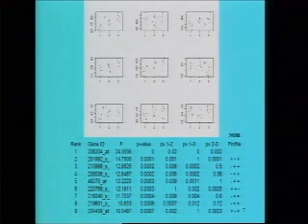So this rank 2 gene and rank 9 gene are such that for these two genes the expression is at a low level in the obese group and at more or less a similar level in the remaining two groups. So this is how one can decide the profiles of these top ranked genes, and then these are further investigated by biologists.